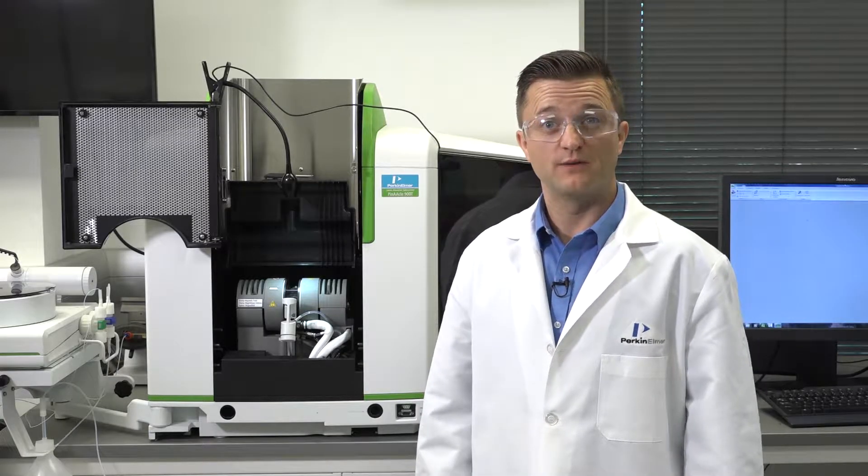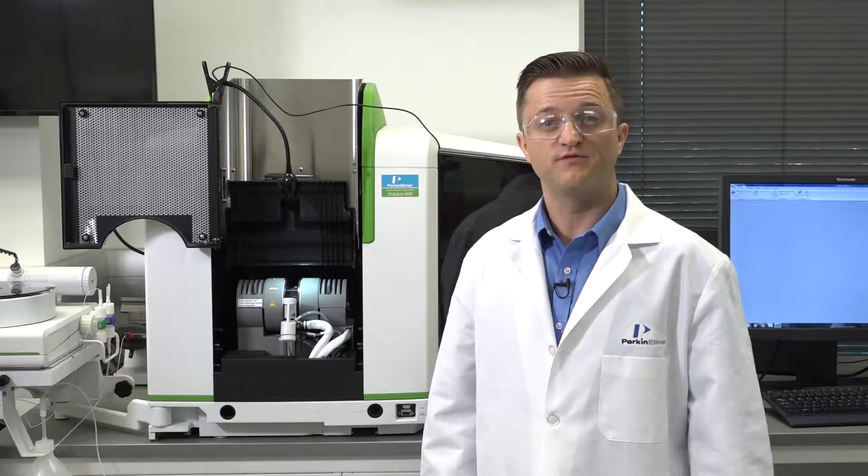Hi, welcome to a brief PerkinElmer video on maintaining your high performance Pinnacle AA system. I'm Aaron Heineman, and in this video I will demonstrate how to clean your graphite tube contacts.